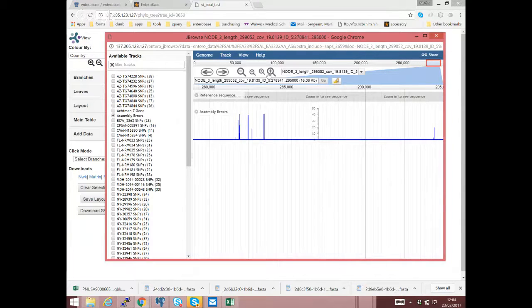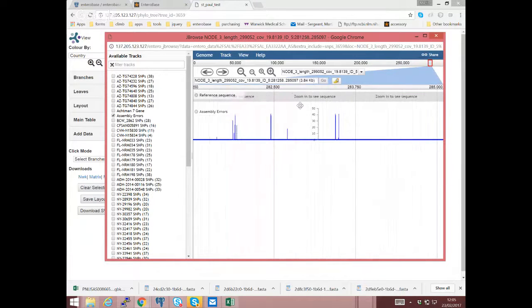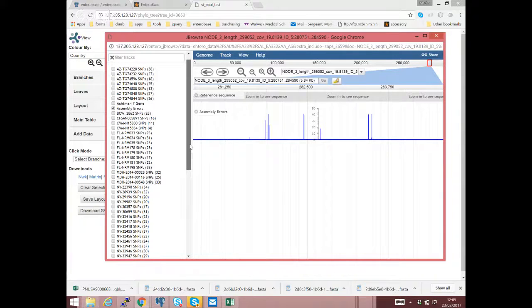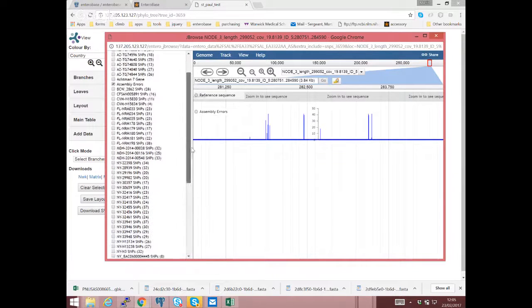So these are just the FASTQ values. You can see in some regions, a few bases have very poor Q30 values. So if you have SNPs in these regions, I think they should be filtered out.